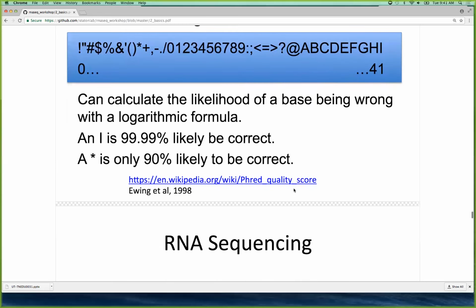So you said that FastQ comes off the machine. Yes. How do you go from Q to A? Software, lots of software. We'll do that in this class, and Miriam will talk about this after the file system game. It also depends on if you want to go to FastA. If you're not doing an assembly, you don't necessarily care about ever arriving at FastA. All you care about is mapping your reads, getting your quantities out, and then doing your differential expression on those numbers. So your end game might actually be to get quantities of gene expression in each sample. You may never see a FastA, which is okay too.